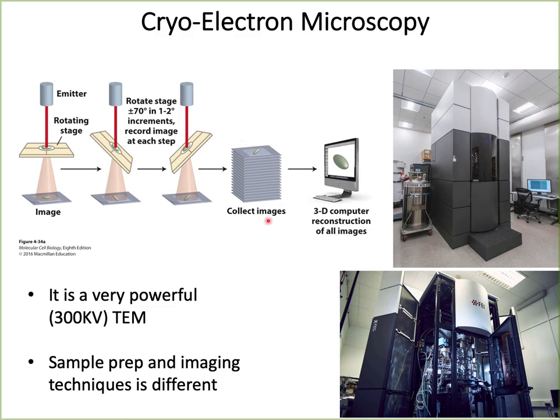Now, all these collected images are processed by a 3D computer. Reconstruction of all images gives you a 3-dimensional image. It's an extremely powerful algorithm, and nowadays the power of cryo-electron microscopy is at atomic resolution. It is a mind-boggling technique and a state-of-the-art procedure.